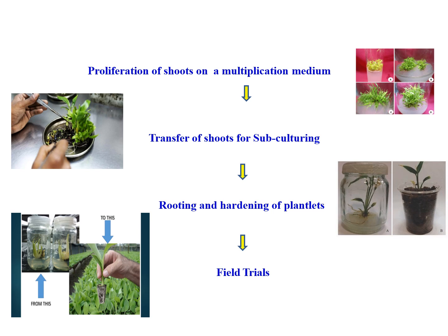The rooting and hardening of the plantlet is very essential. Like a child, we have to take care of these younglings for getting rooting. After getting better rooting, elongation or multiplication of roots, we should do the hardening of the plantlets by the process.